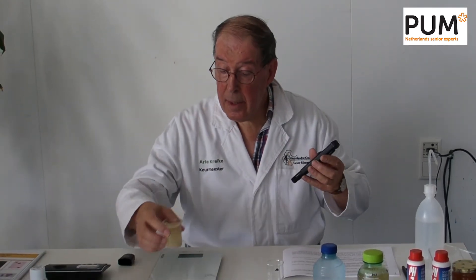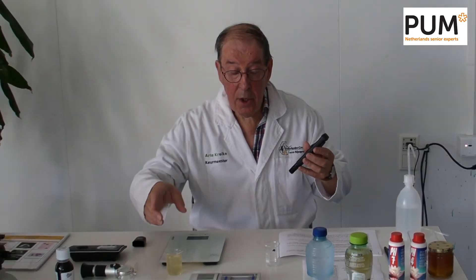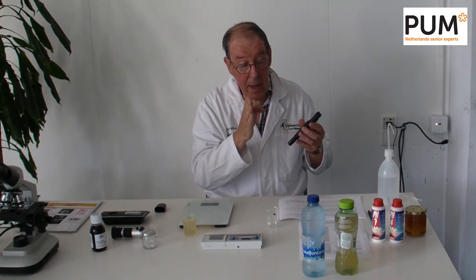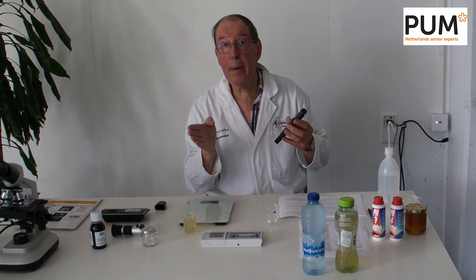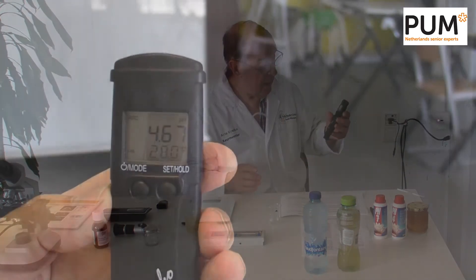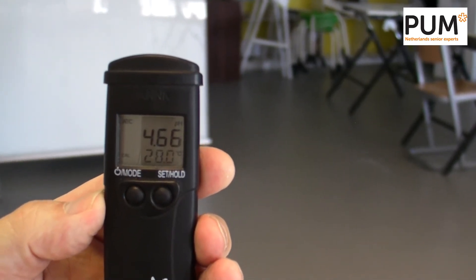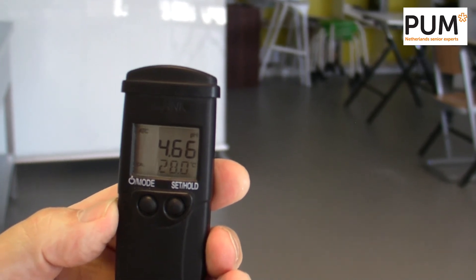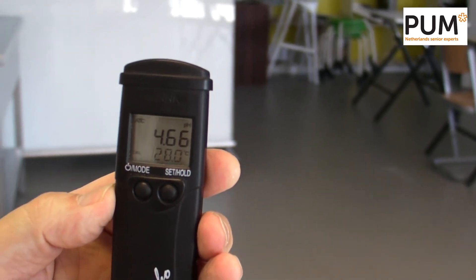The reading is a pH of 4.66. That means it's a real, normal honey, because 4.6 is nicely in the middle of 3.2 and 6.1. So there is nothing wrong with the pH.